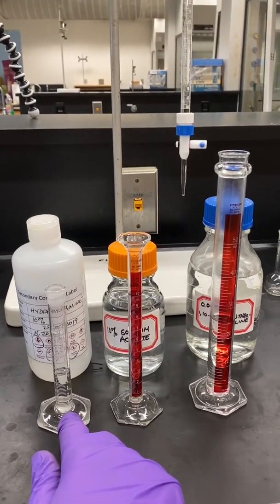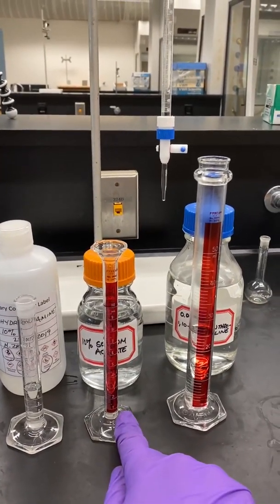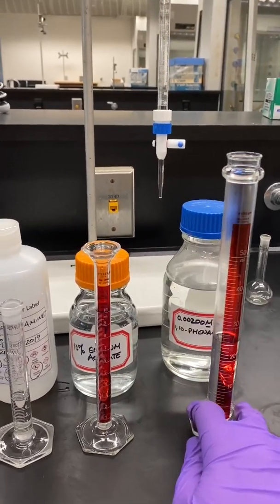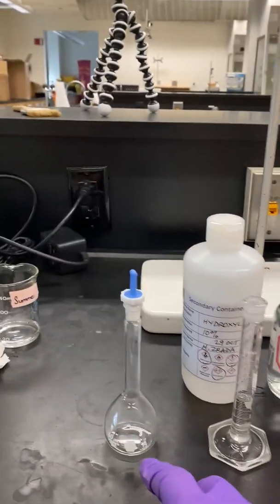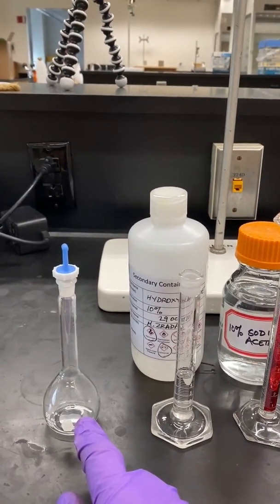Next, we'll add 5 milliliters of 10% hydroxylamine, 10 milliliters of 10% sodium acetate, and 25 milliliters of 1,10-phenanthroline solution to the volumetric flask that contains the 1 milliliter of ferrous ammonium sulfate from our burette.